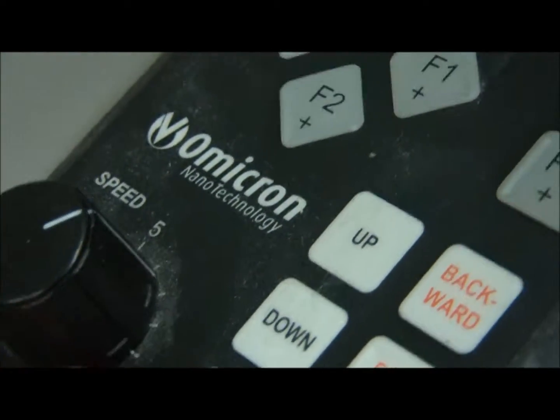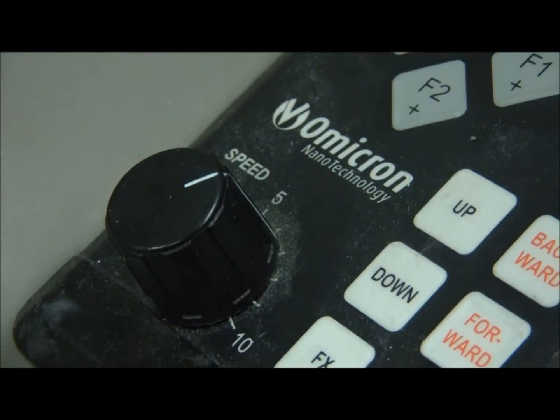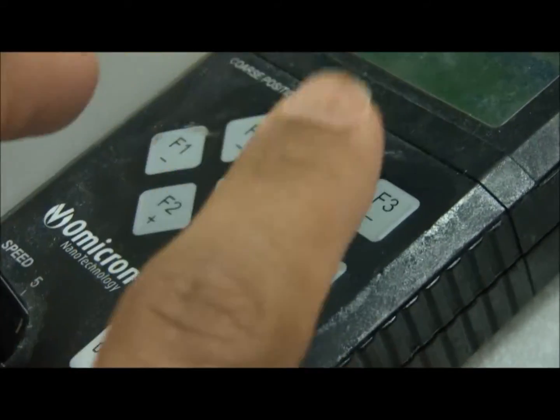If you get impatient and you turn this to ten so it can approach faster, you'll have to remember to turn it back when you're doing the manual approaching right here. Otherwise, you'll run into the tip, or run into the sample.